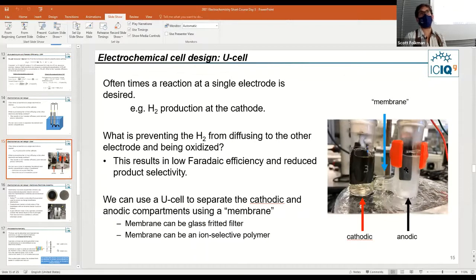So for example, if I'm applying 5 volts and I'm in an acidic solution and my counter electrode is platinum, yes, exactly. It'll be hydrogen evolution at the platinum counter electrode, and whatever other reaction will occur will be at 5 volts versus approximately RHE. It might shift around a little bit. That's the disadvantage of a 2 electrode cell, is that it will shift around. The exact applied potential at one of the electrodes might move.